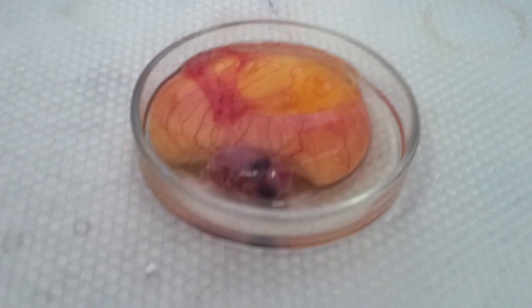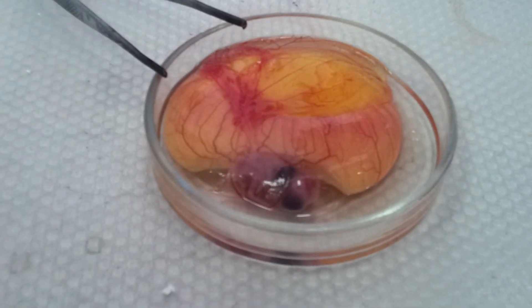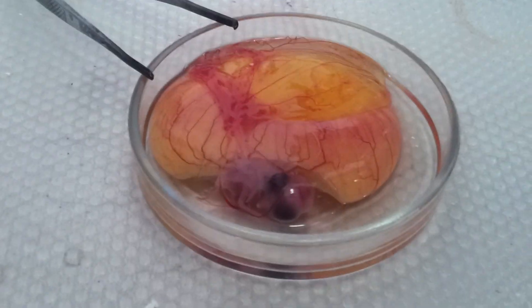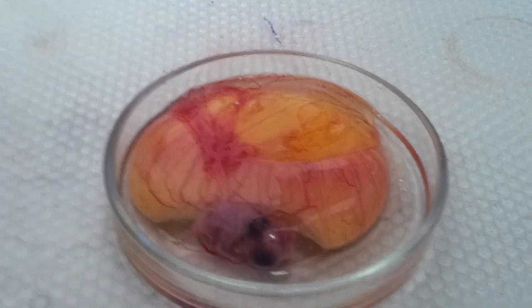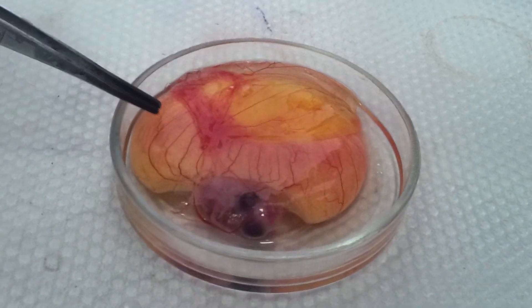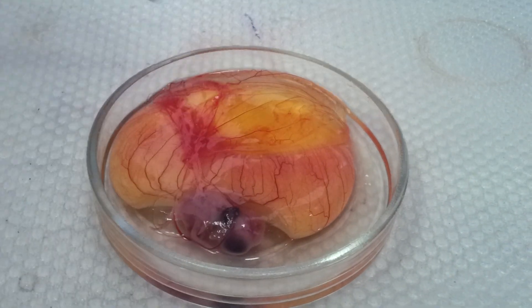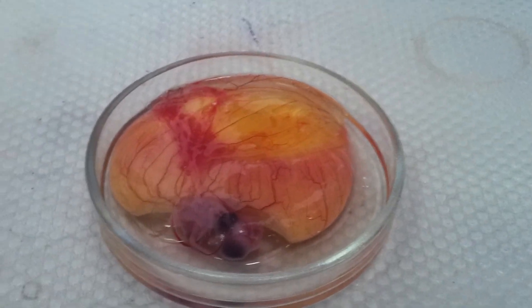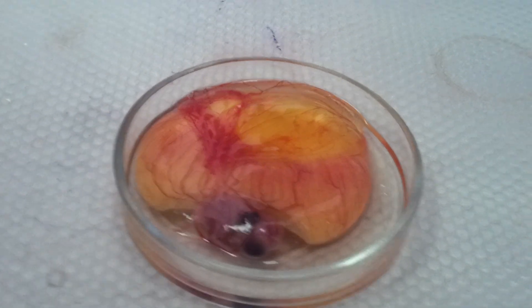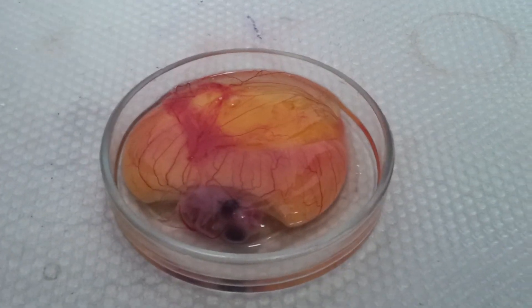Is it moving? Is it alive? Of course it's alive! It's a very big one, of course, because there is a lot of new growth. We usually use embryos of seven to twelve days old.